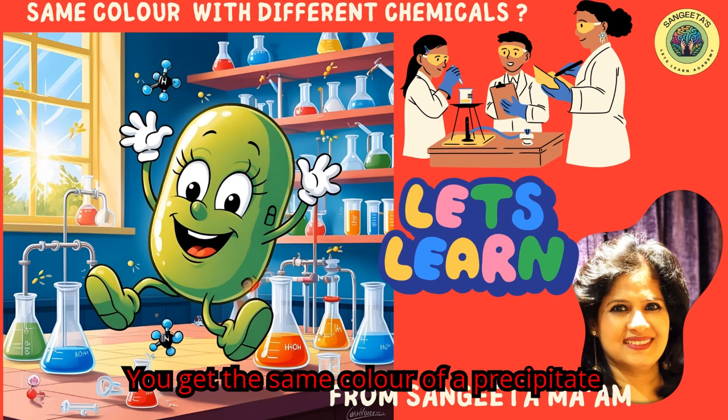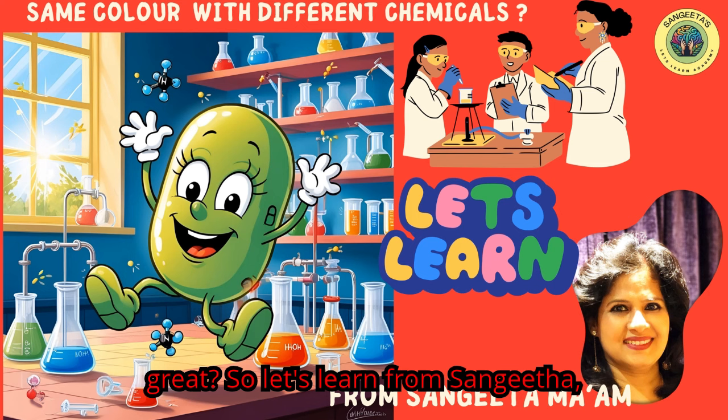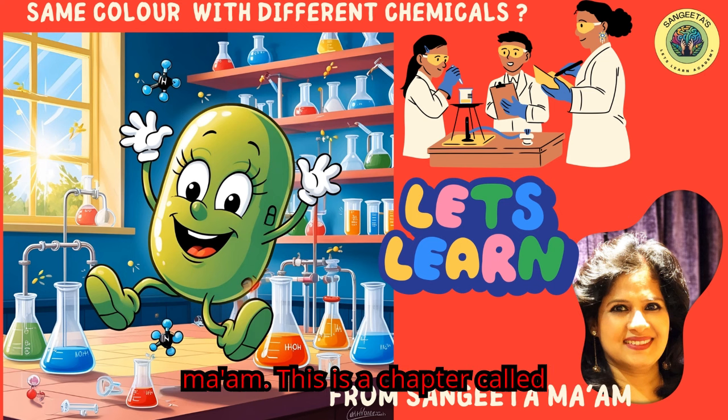You get the same color of a precipitate with different chemicals. Wow, isn't that great? So let's learn from Sangeeta ma'am.